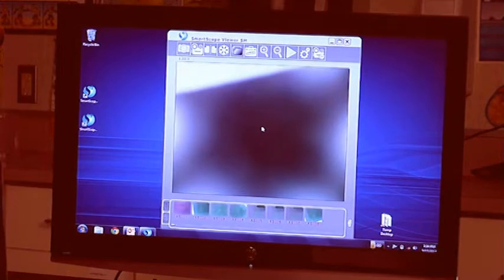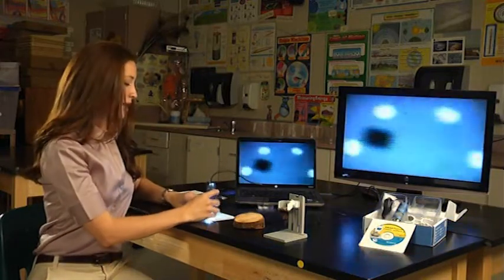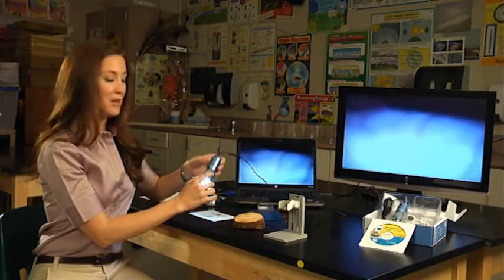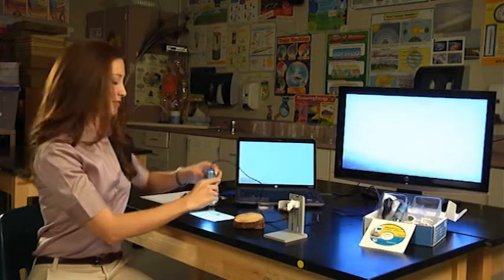First, I'm going to double click on the image. That'll take us into full screen mode so everybody has a clearer view. You can use the SmartScope 5M just like a traditional microscope. So first, I want to analyze a slide of an onion skin. You're going to want to use the dial at the bottom of the SmartScope 5M all the way over to the right to start off.